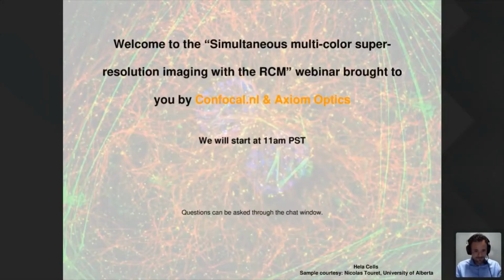So today we're going to talk about simultaneous multicolor super resolution imaging with the Re-scan Confocal Microscope. And this will be a theoretical session first, and after that I will do the live demonstration of this.